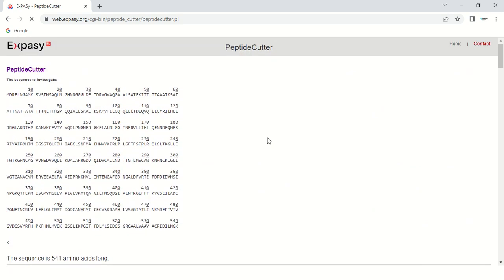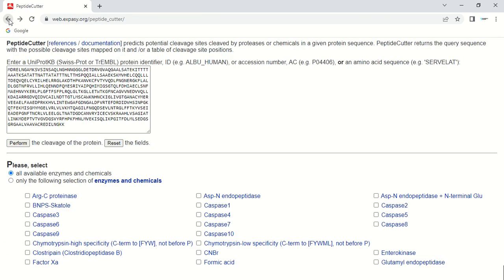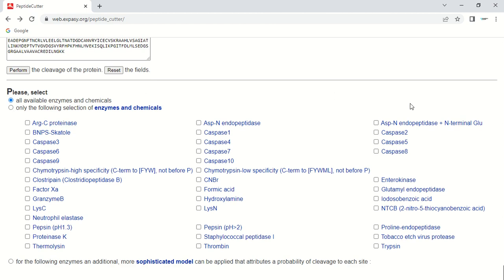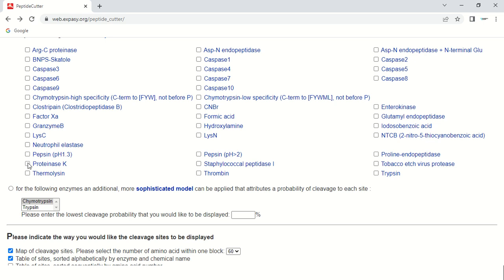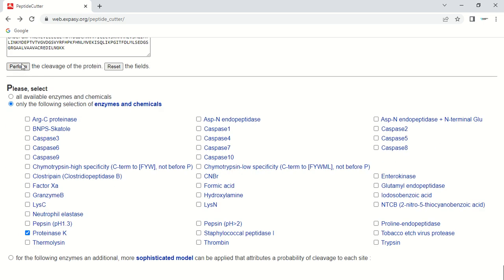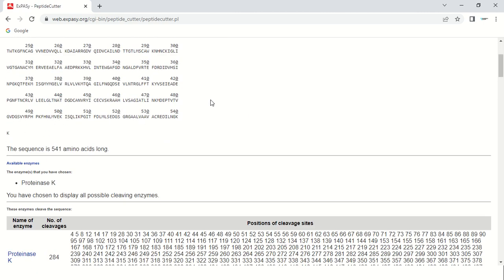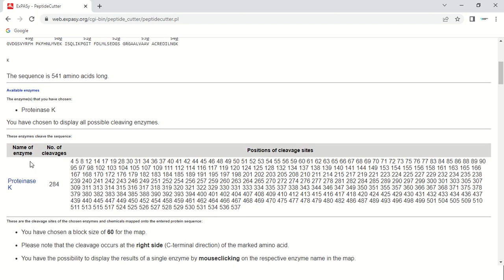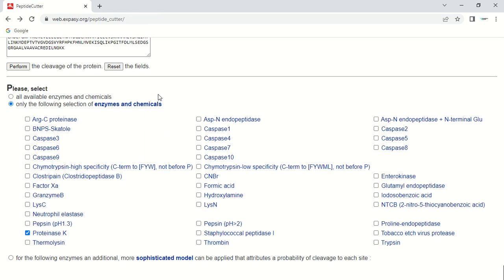You can also select a single specific enzyme. Going back to the homepage, if you want to select only one or two enzymes rather than all of them, just check the 'only the following selection' option and choose your enzyme — for example, Proteinase K — keeping the rest of the options the same. Click 'Perform'. The results now show only the selected enzyme, Proteinase K, which cleaves 284 times within the sequence at positions 4, 5, 8, and so on.